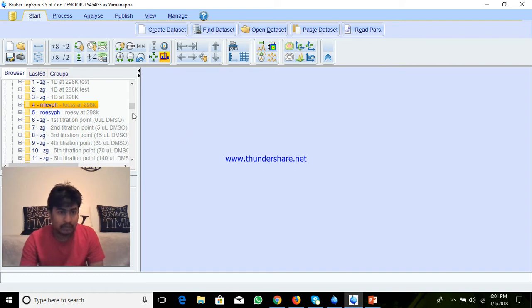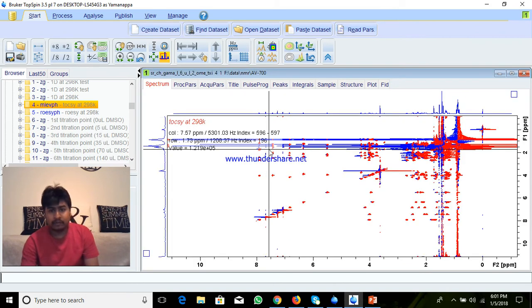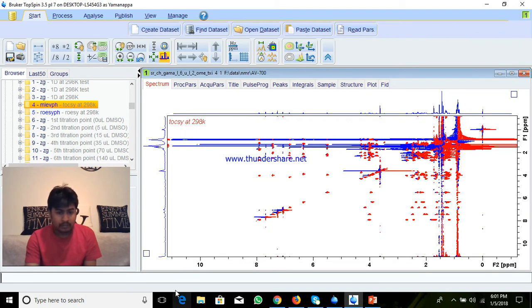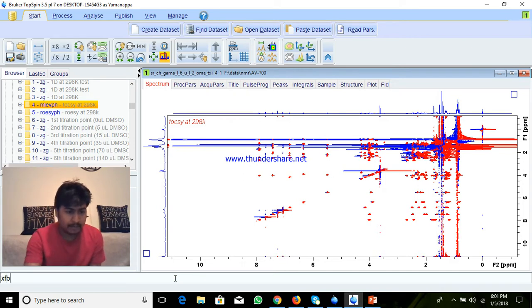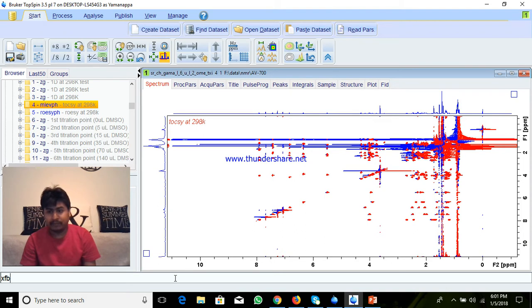In the newer version of TopSpin, you just drag and drop and it will do Fourier transformation automatically. Otherwise, you have to give a command like xfb for Fourier transformation for both dimensions f1 and f2, and it will do xfb.